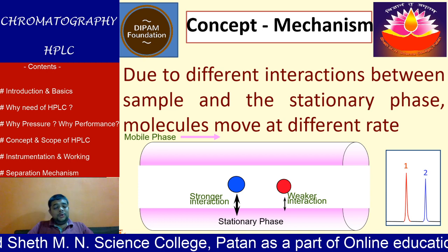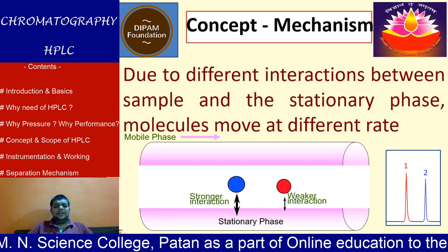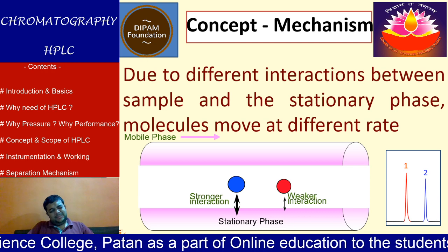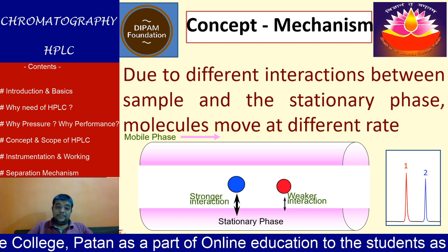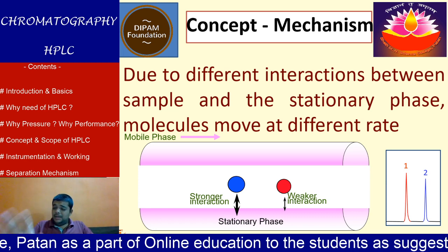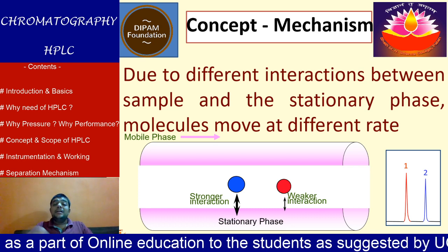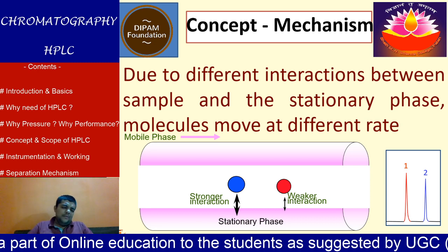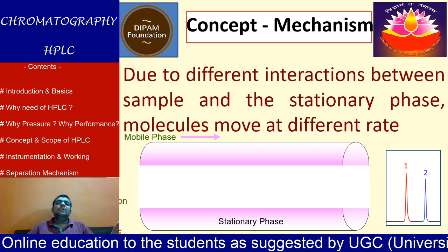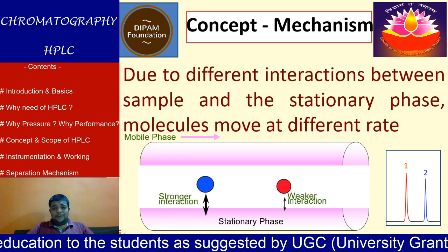Because if you go to the first video where chromatography was discussed, after the complete classification of chromatography, we could come to a conclusion that there are two modes of mechanism behind any technique used in chromatography, of which one mechanism was adsorption, one mechanism was partition. And when the stationary phase is considered to be solid in general, we go for the adsorption mechanism, which we are doing here.